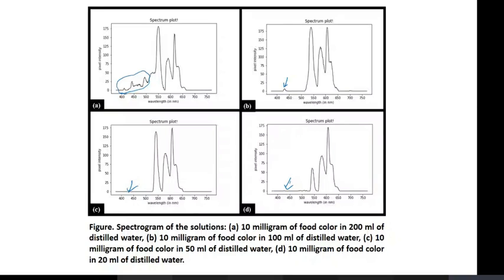If you do not have any costly equipment, how you can make a roundabout and get your things done, in Hindi it's called jugaad. How you can make a jugaad and get your work done. Okay. So this is how you can develop your own spectrophotometer in your own lab, and you will find a lot of videos on YouTube also. Okay.